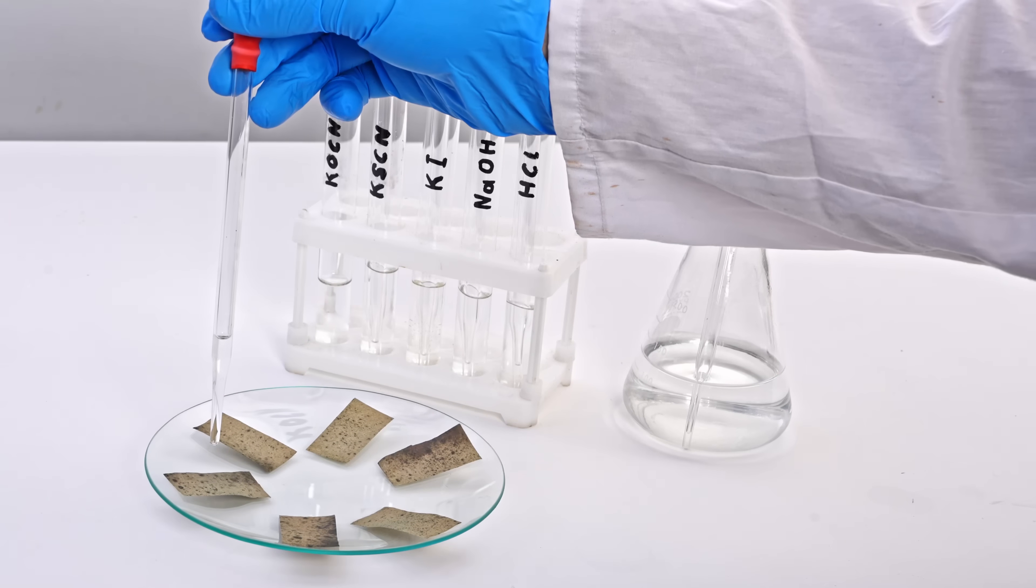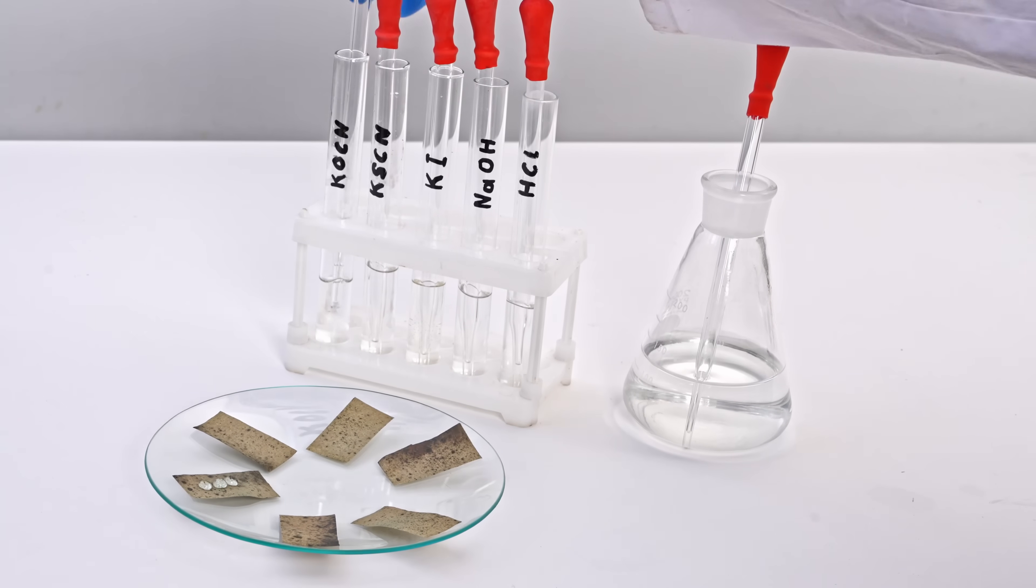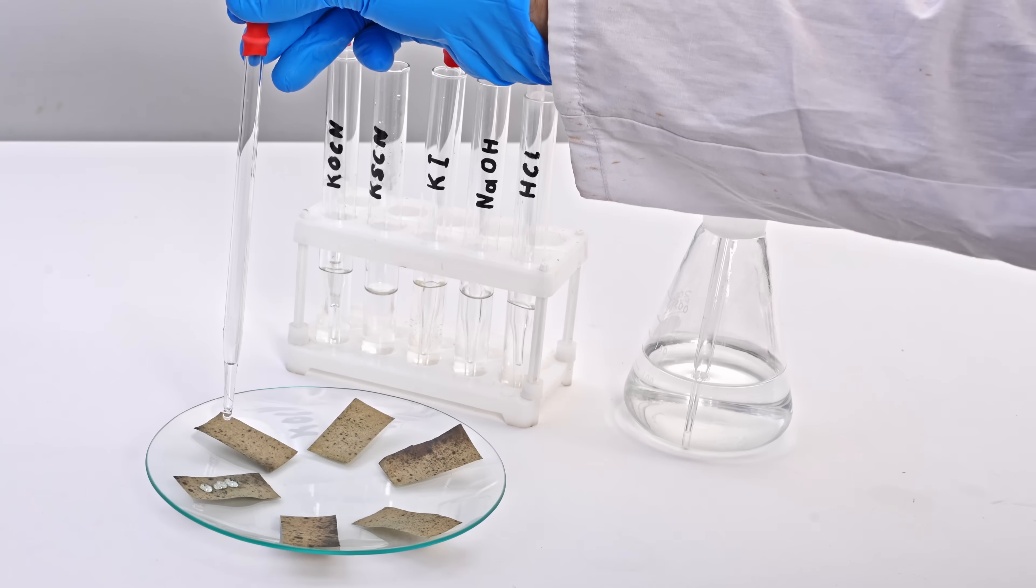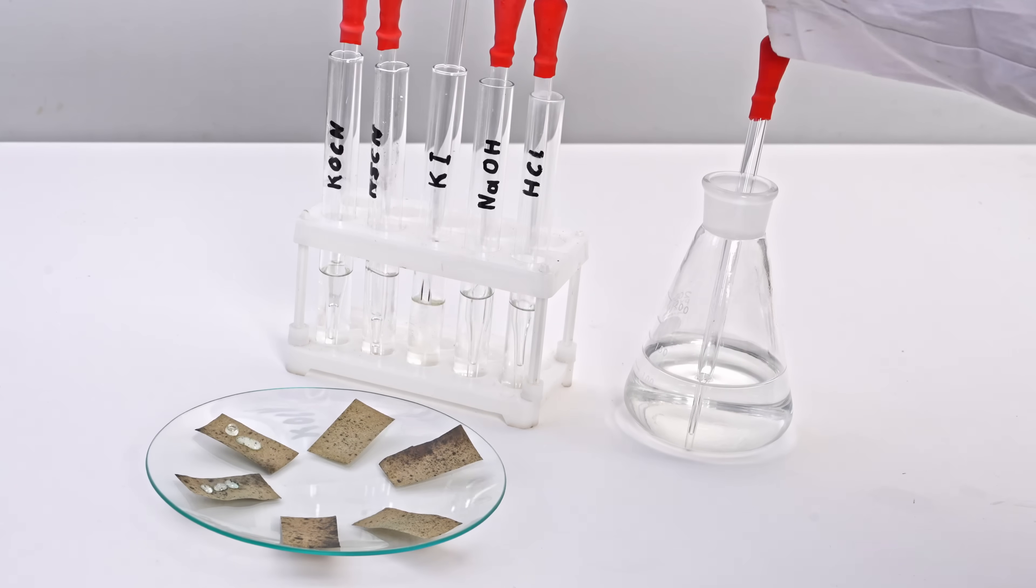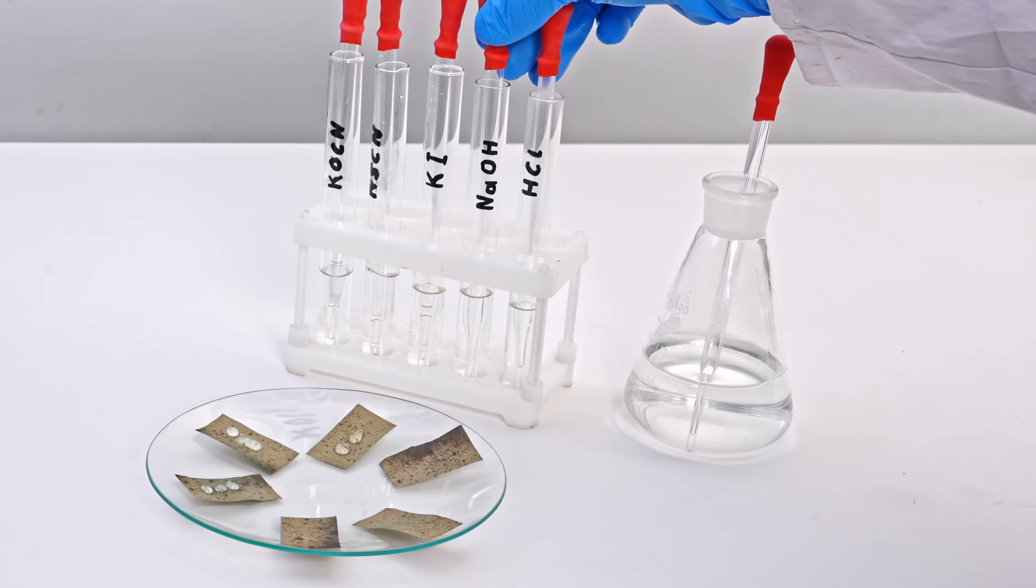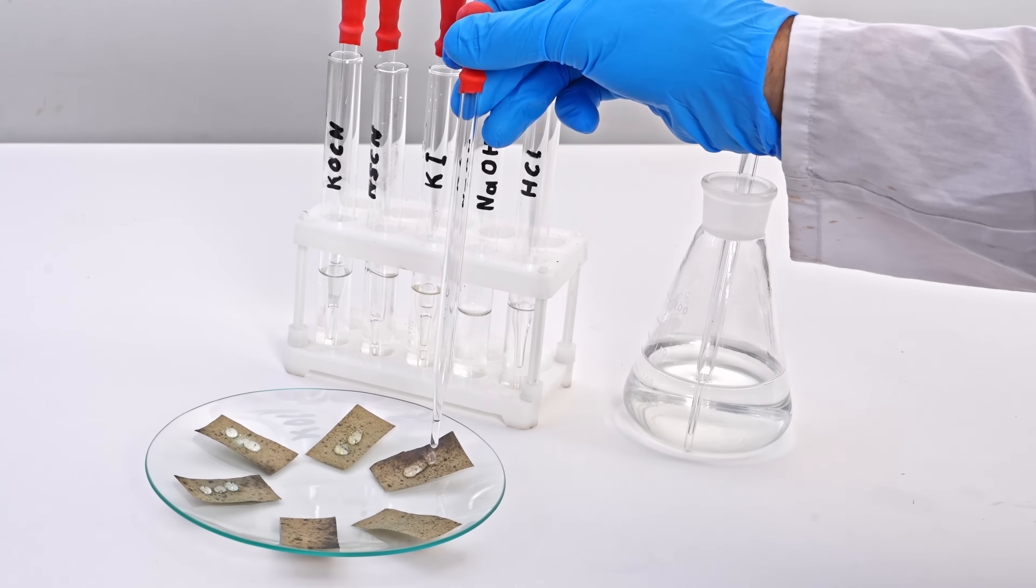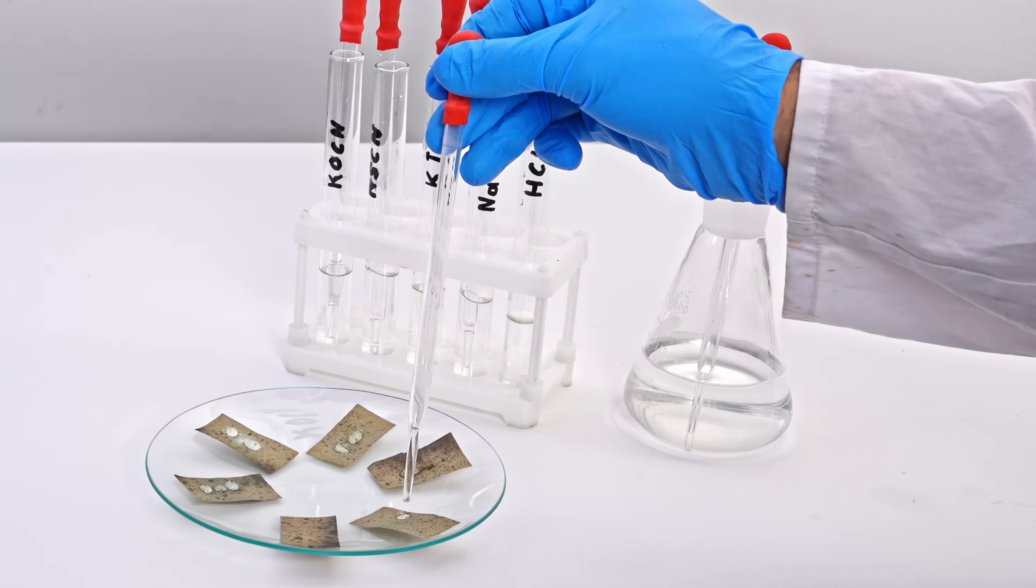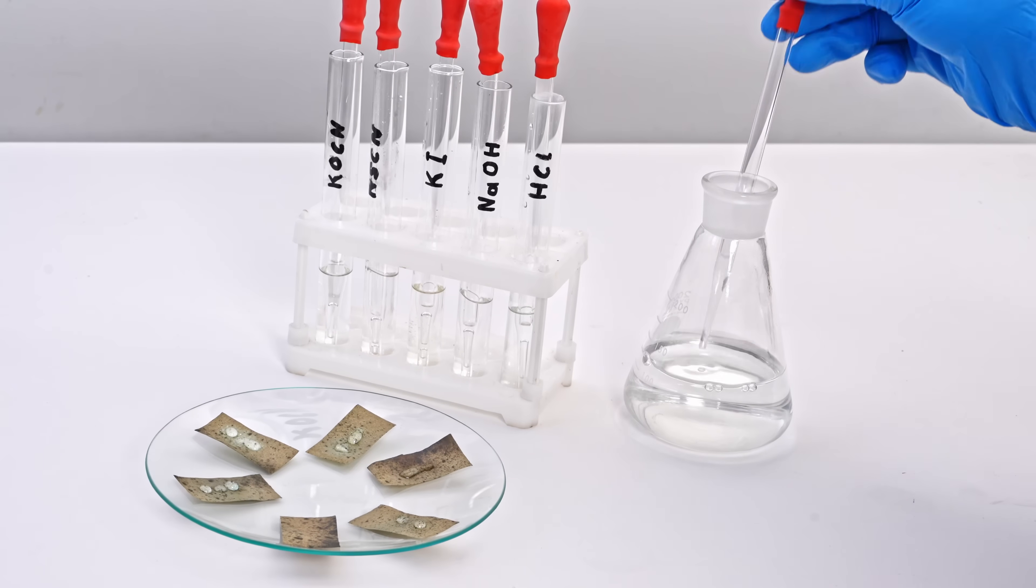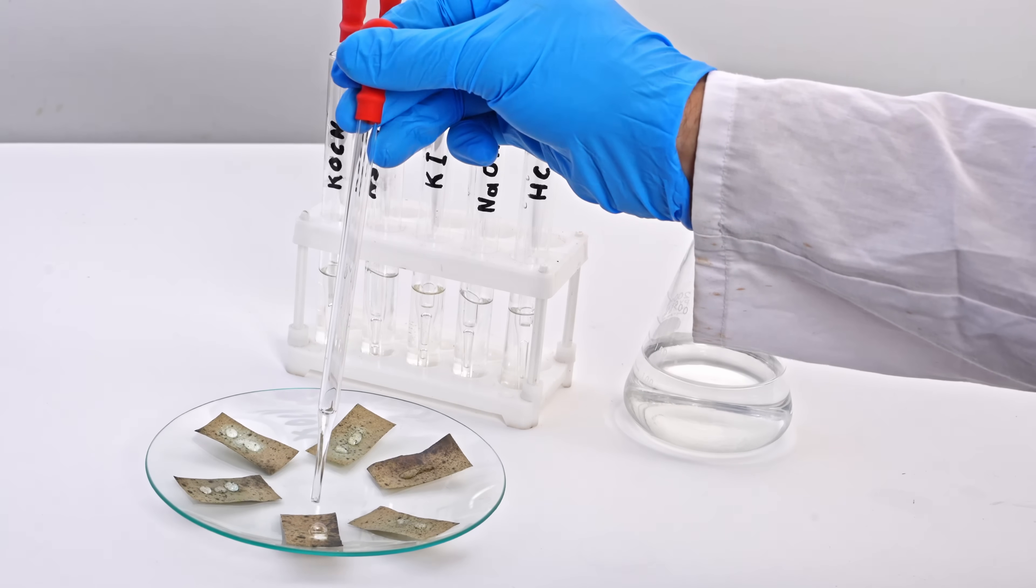To demonstrate, I'll test various solutions on the paper and only those containing cyanide ions will cause the brown color to disappear. By adding a few drops of each solution to our indicator paper, we can see that only in the presence of cyanide ions does the brown color of the paper quickly dissolve and the paper becomes white.